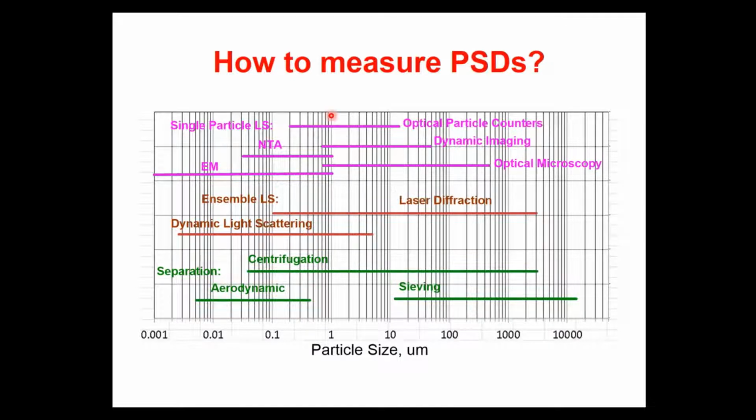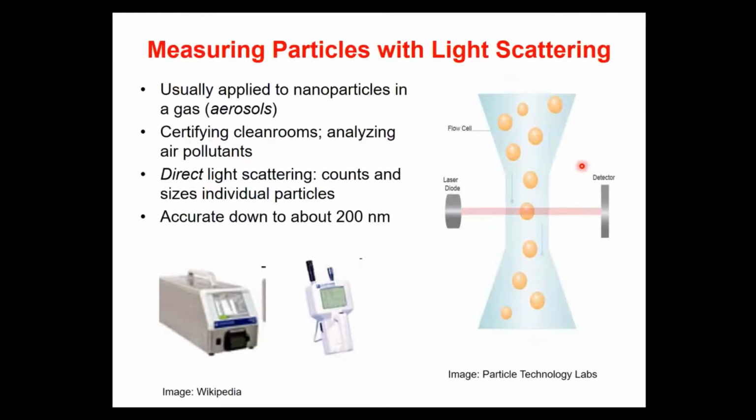But looking at the single particle approach used in optical microscopy, one way to automate that is with an optical particle counter. And these are used in a number of industries, in particular clean room certification and also analyzing air quality.